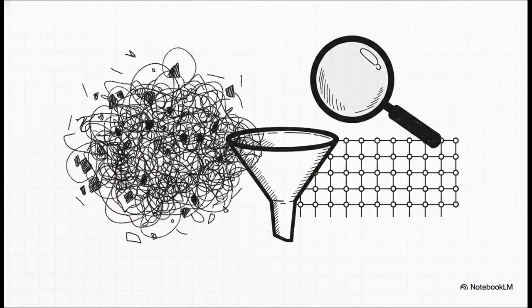We've built this model all the way up from a simple cartoon analogy to complex thermodynamic equations. So let's bring this explainer home by assessing its true value in modern science. The source text explicitly calls this model obsolete, but why? Well, primarily because its major limitation is that it fundamentally fails to account for the dispersion in the column caused by the actual physical diffusion of compounds.